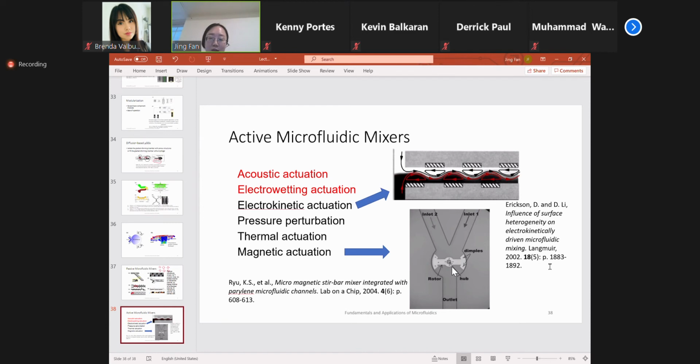So there will also be some electrodes integrated into the microfluidic channel, which, by applying an external electric field, you can manipulate the movement of the droplets in the channel to merge them, or even to separate them. It is to induce the mixing between different droplets.